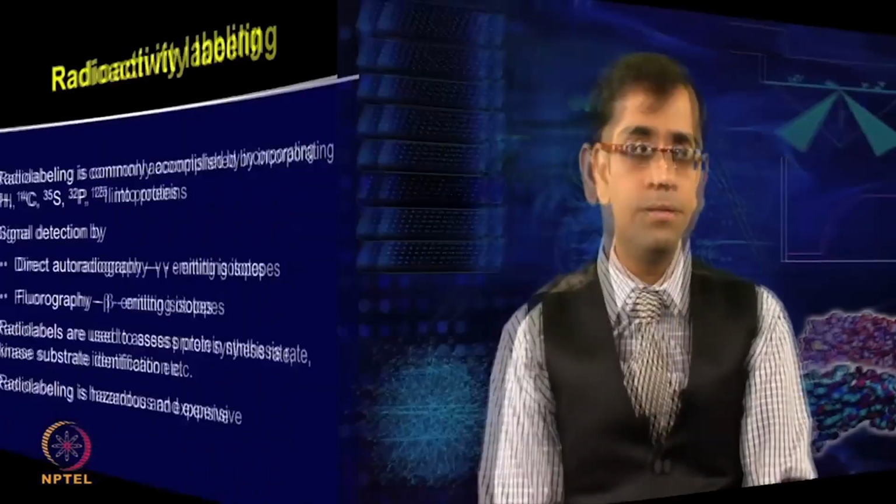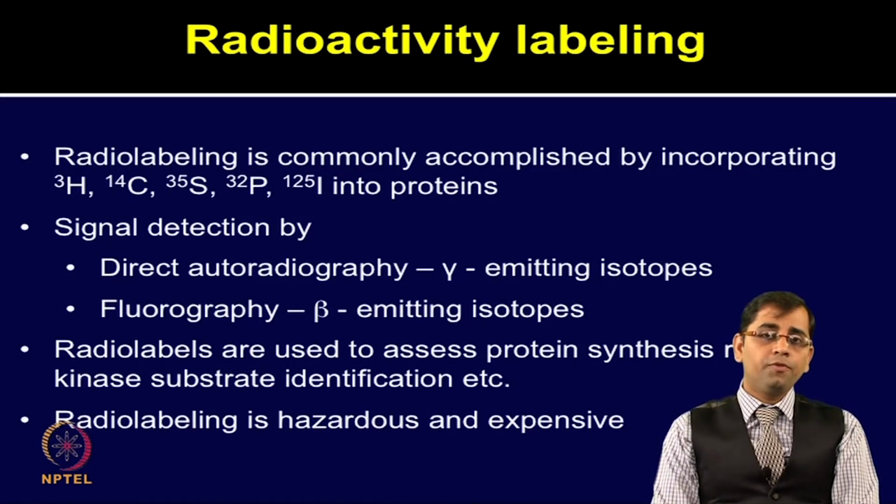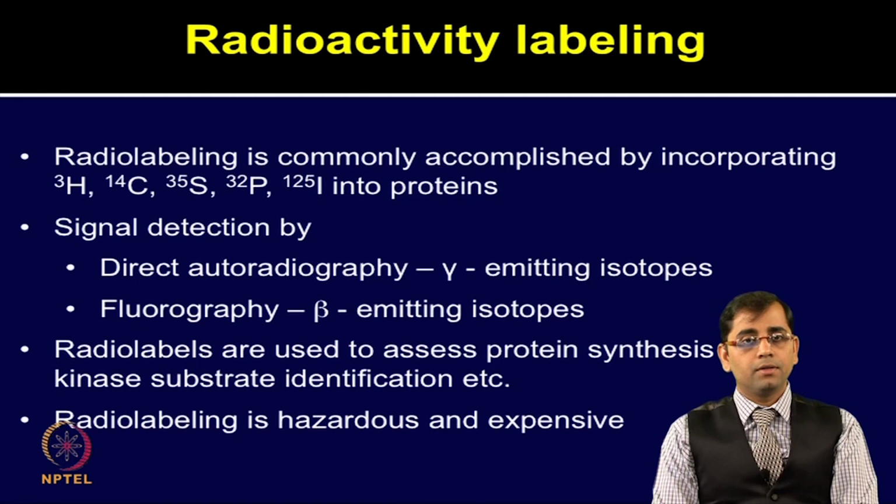There are various biological applications of radiolabeling like detection of antigen-antibody, protein-protein, protein DNA and protein RNA interactions on microarray surface, where binding can be studied through emission of radiation, on binding of query protein or antigen to the corresponding target molecule. In radioactivity detection, various types of radioactive molecules are used.